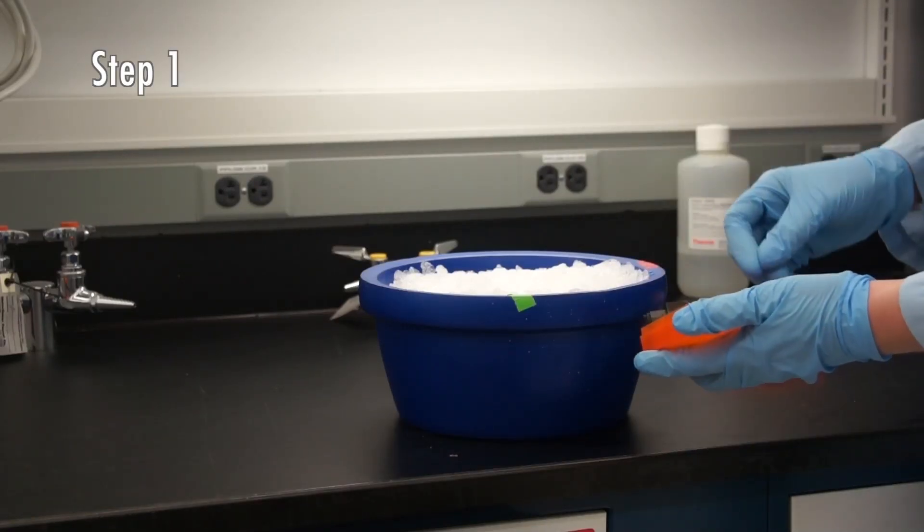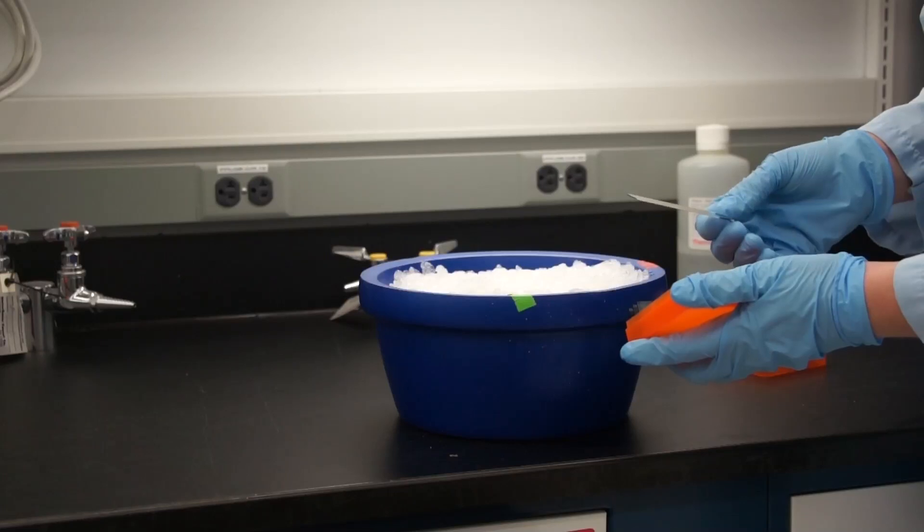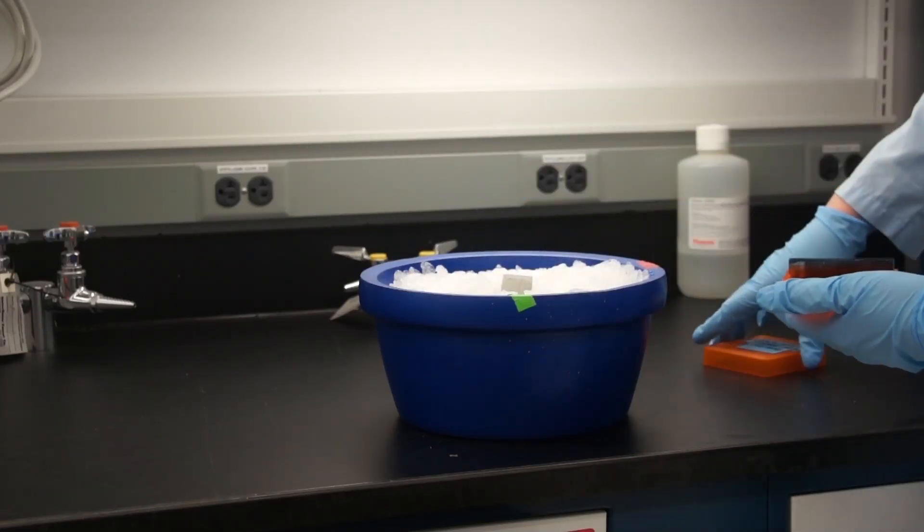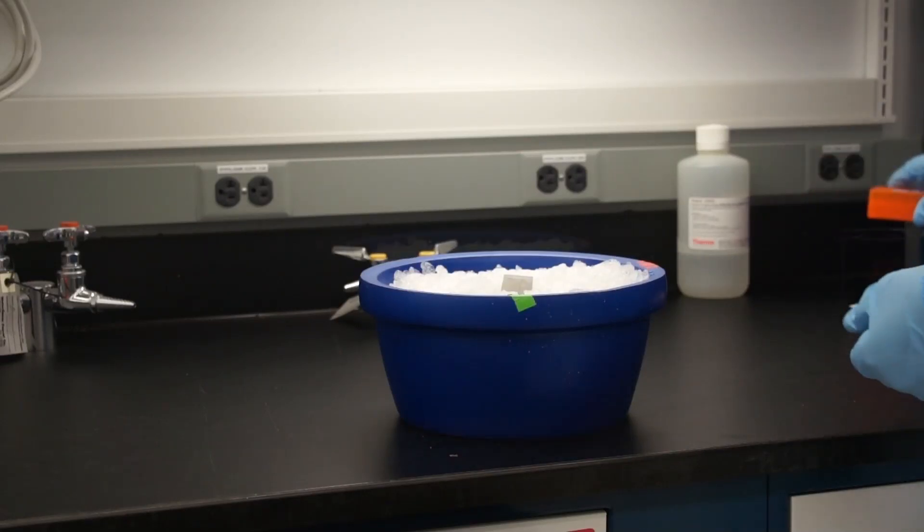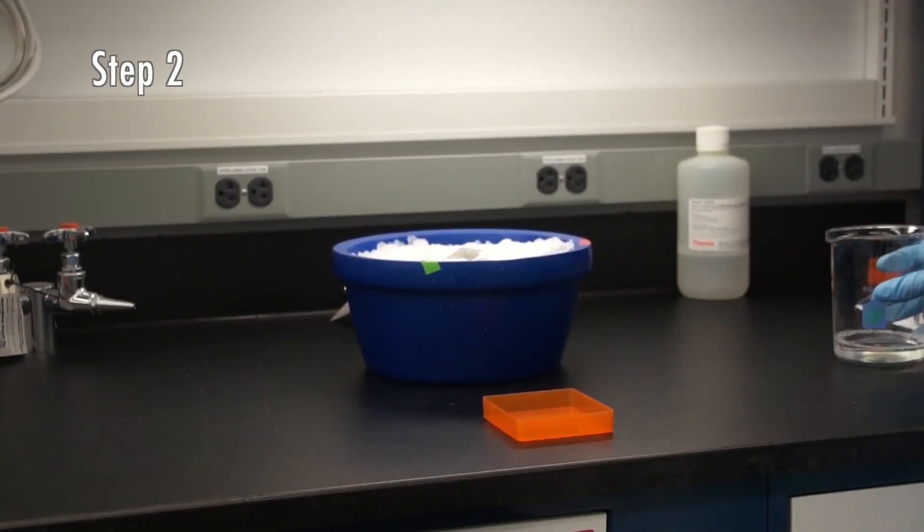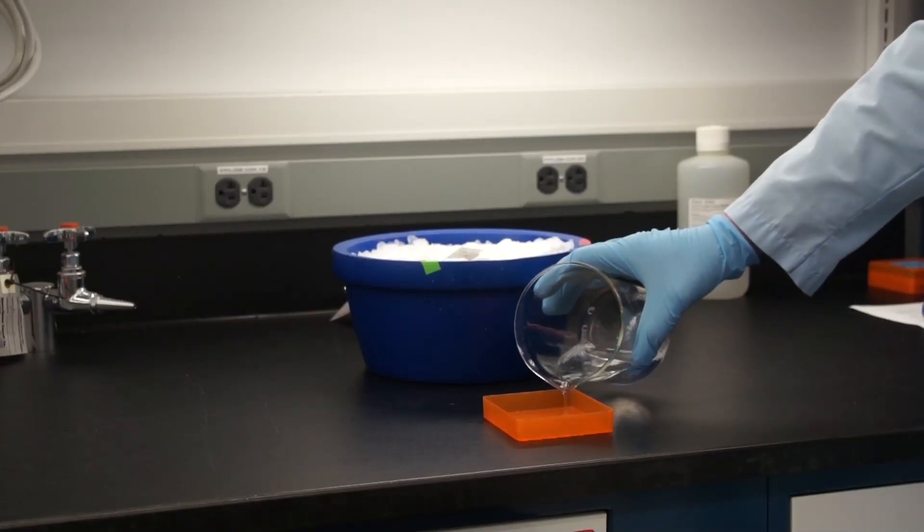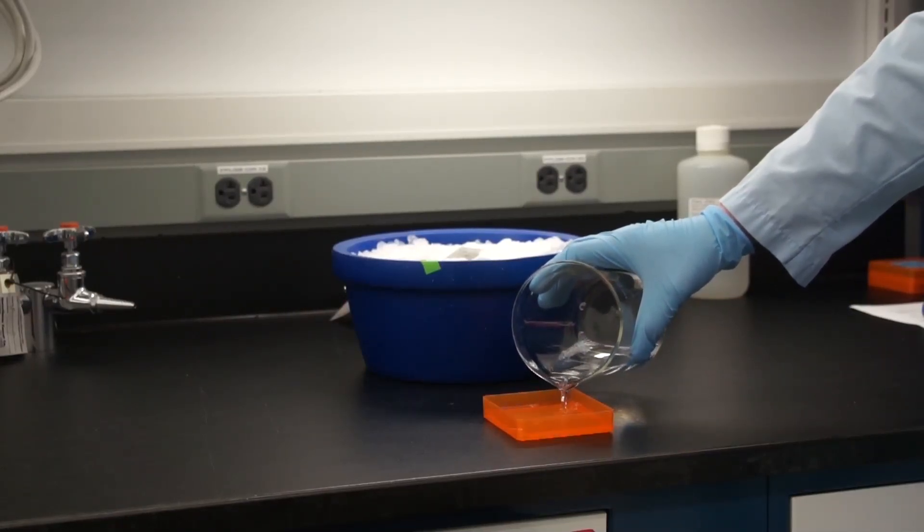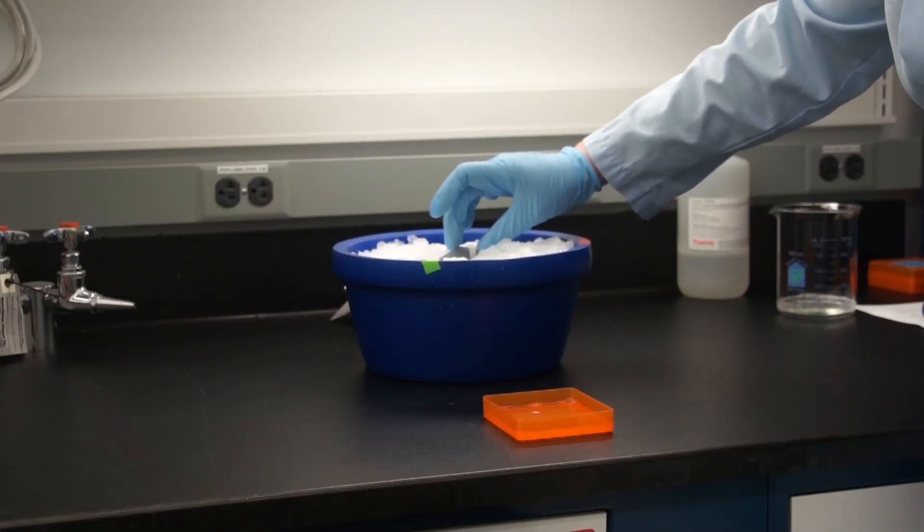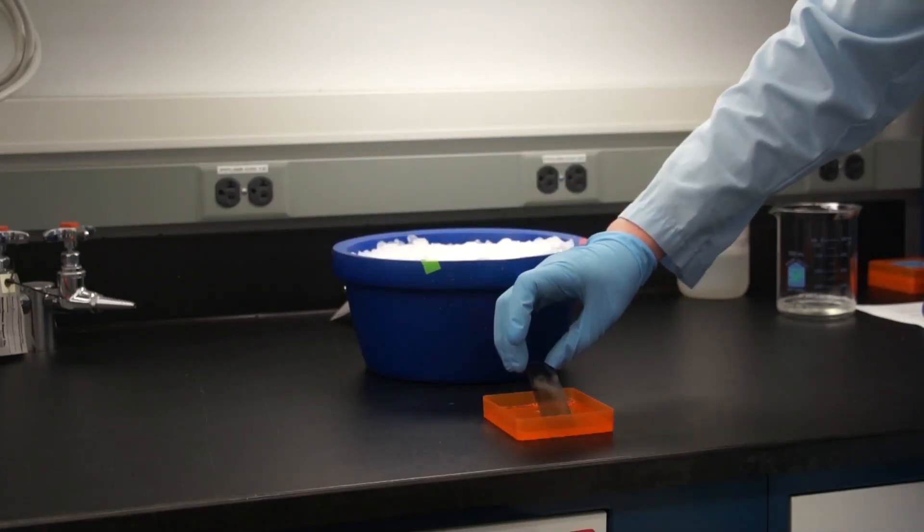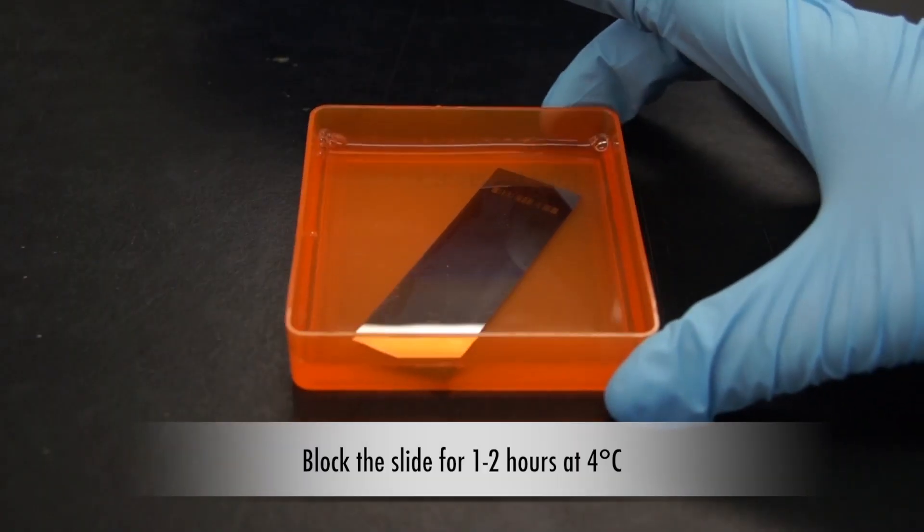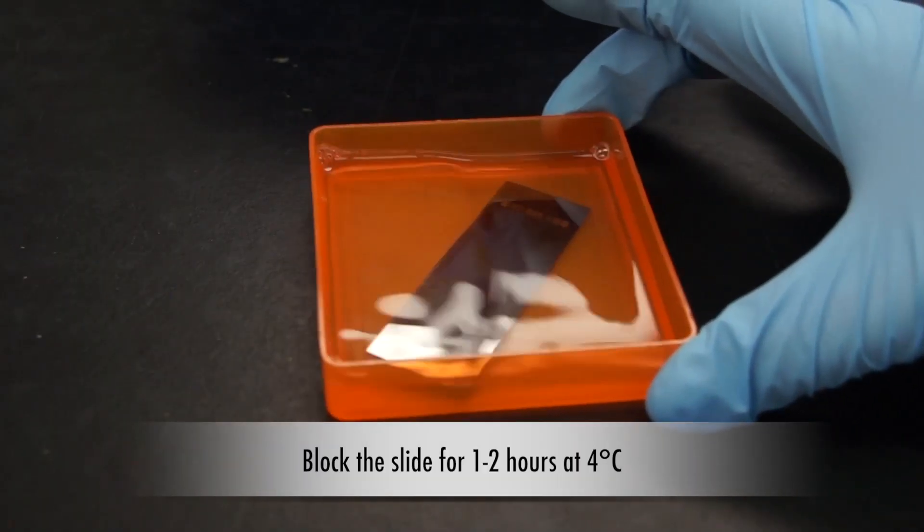We'll start by thawing the protein microarray on ice for 5 to 10 minutes. Next we'll pick up the slide by grasping the sides of the slide or the barcode and submerge the slide all at once in superblock buffer. Set that in the fridge and incubate for 1 to 2 hours to block the slide.